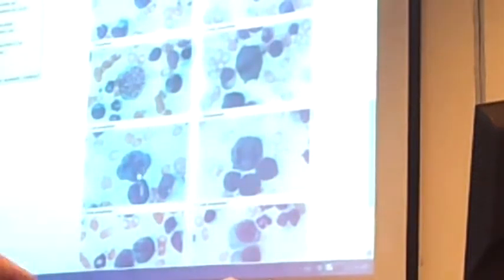Here you can see early anaphase has started - the chromosomes have divided into two and are moving towards the opposite poles. This is early anaphase, and this is late anaphase where chromosomes have completely moved. Then they make two cells - this is telophase, where from one cell, two cells have formed.